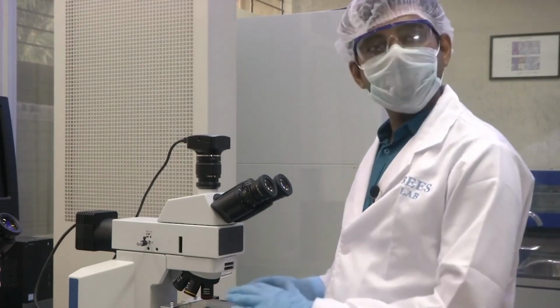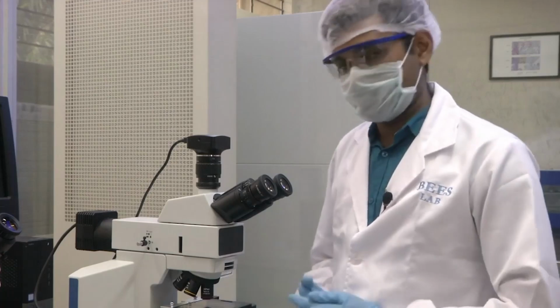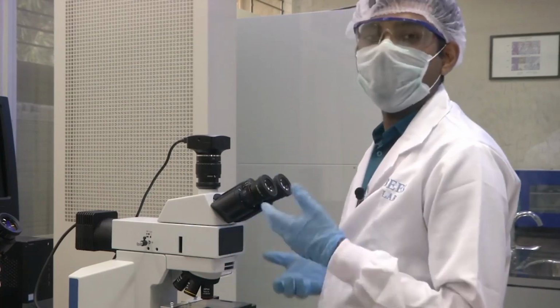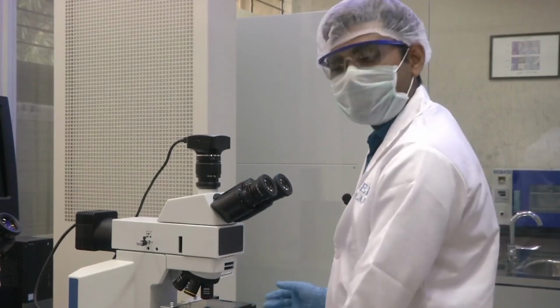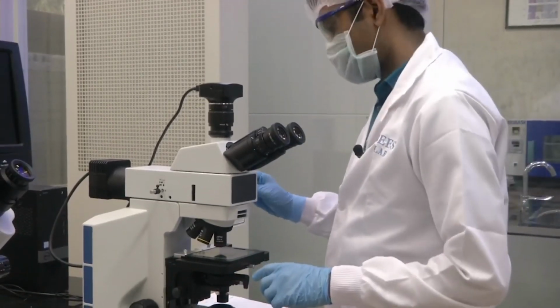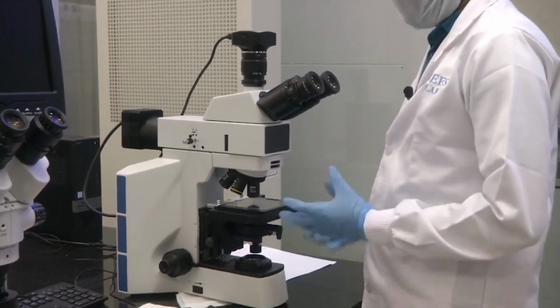Fluorescence microscopy can also be done with this microscope. We will not get into that much detail because that is a more biology-oriented thing, and this is a microfabrication course, but we thought that you should know about it. So, this microscope is also capable of carrying out fluorescence microscopy. As I told, there are filters and aperture adjustment equipment like this. We can adjust the aperture like this and then conduct the microscopy.